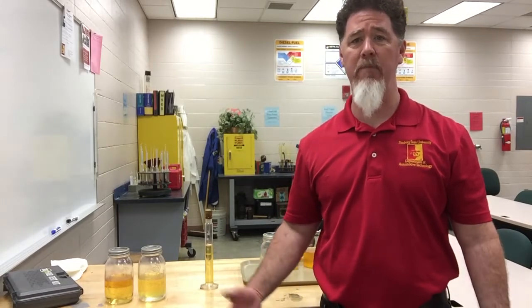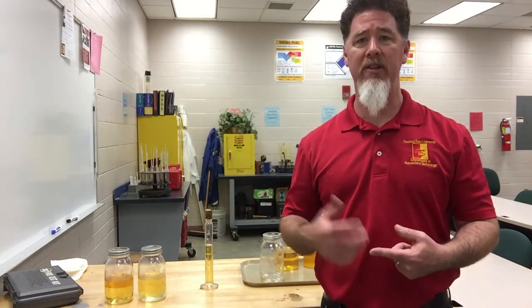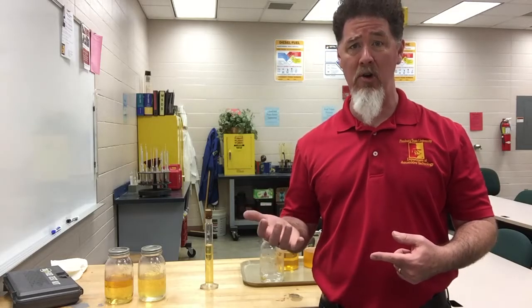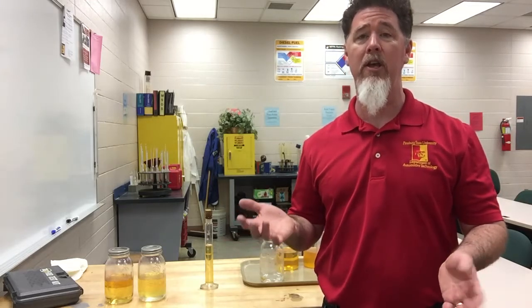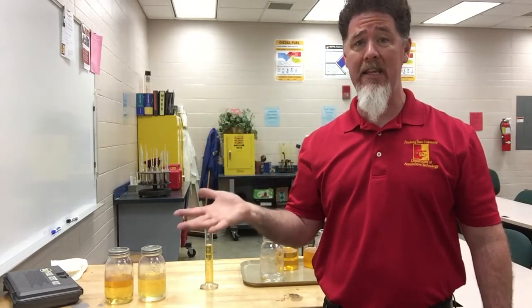Today we're in the PSU Fuels Lab, and we're going to talk a little bit about how a technician determines if they have too much alcohol content in their fuel. So typically, if you put E85 in a vehicle that's not supposed to run it, the adapts are going to go up very high. It's going to be showing a lean condition.